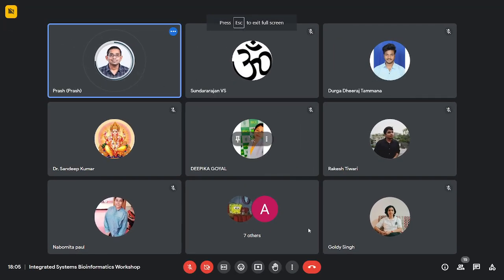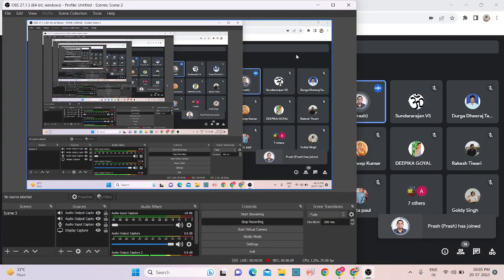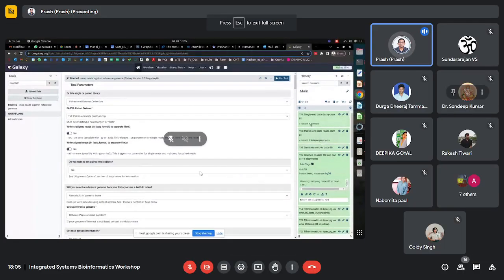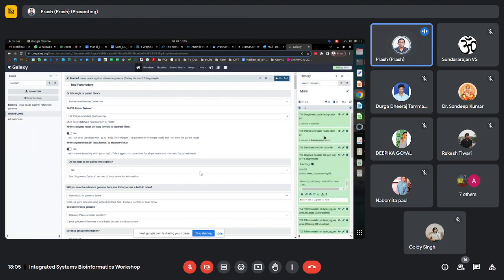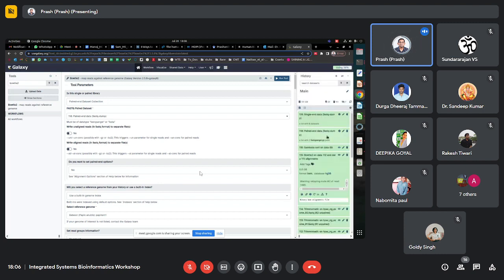Welcome back. Yesterday we were finishing the Galaxy exome sequencing. I was downloading it, and we could get those paired-end data sets, as you could see. These two paired-end data sets are now in my history. One data set is what you call a control, and the other one is a treated data set, which I used yesterday.